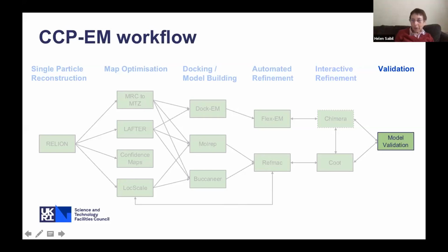Okay, well, loads more questions have appeared, but I'm afraid we're running out of time. I'll just randomly choose one more from Fabrizio Martino. Is the database of MolRep integrated in the CCPM suite? Not at the moment, but it will be in the future.